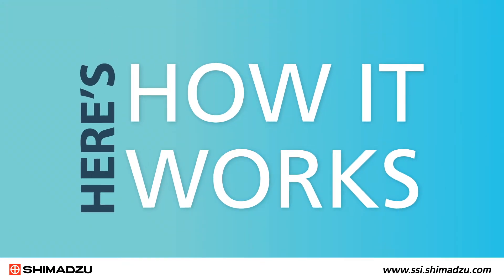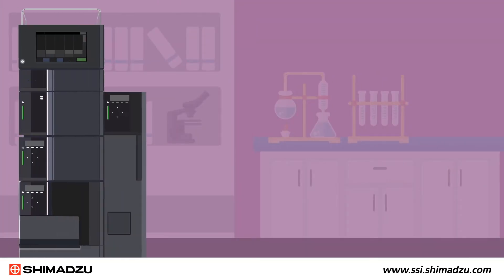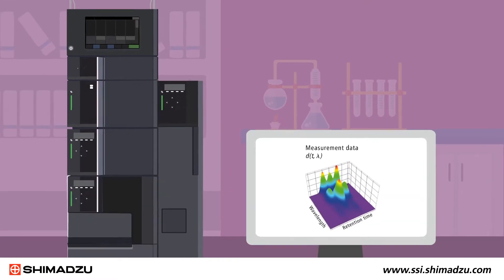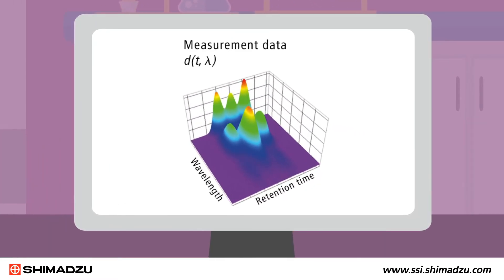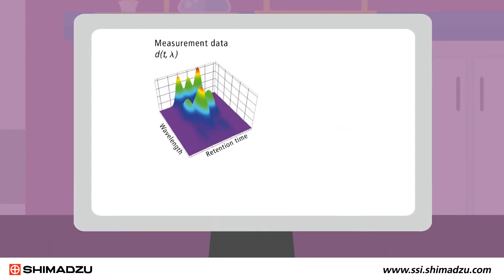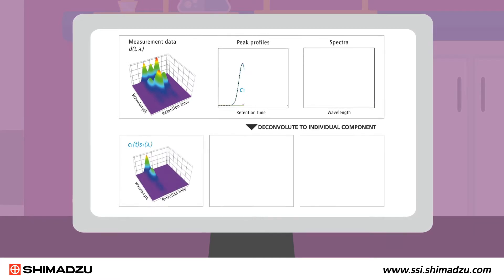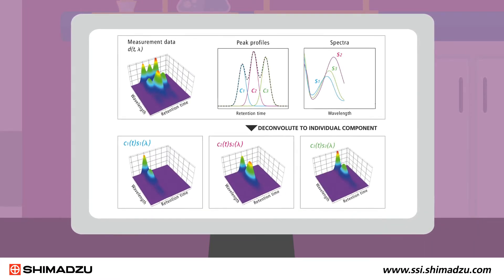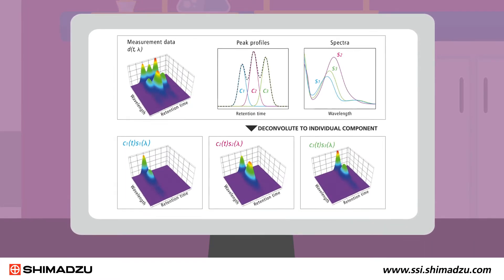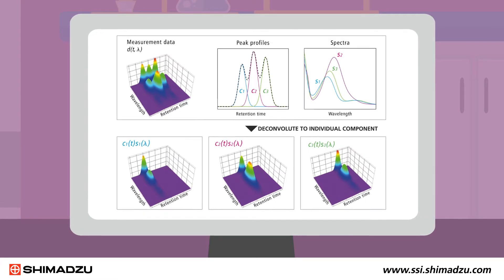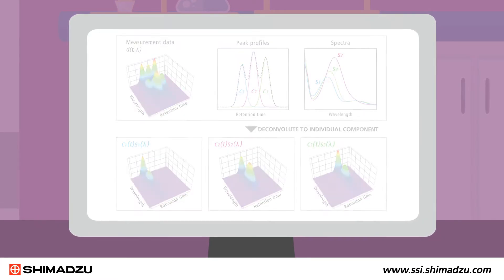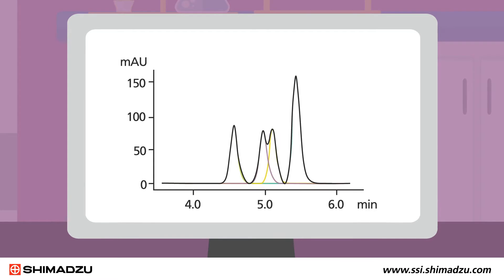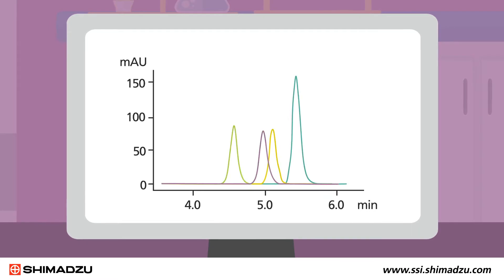Here's how it works. IPDA uses spectral differences to isolate co-eluting peaks and detect impurities and target peaks. This unique software enables users to visualize and detect a minor single impurity even when the impurity is co-eluted with an analyte. It also facilitates the separation of hard-to-separate peaks on the column.